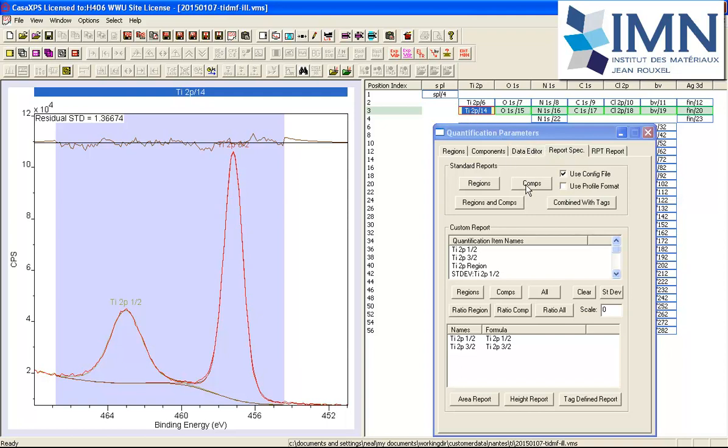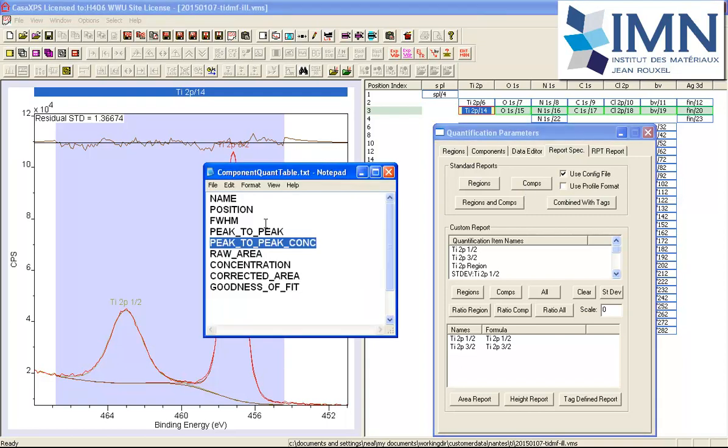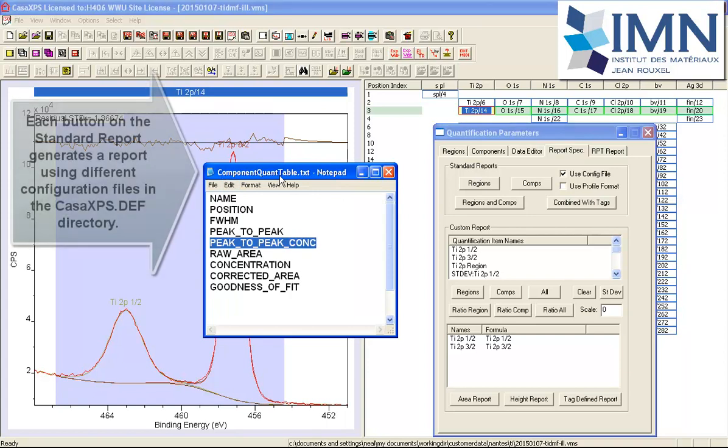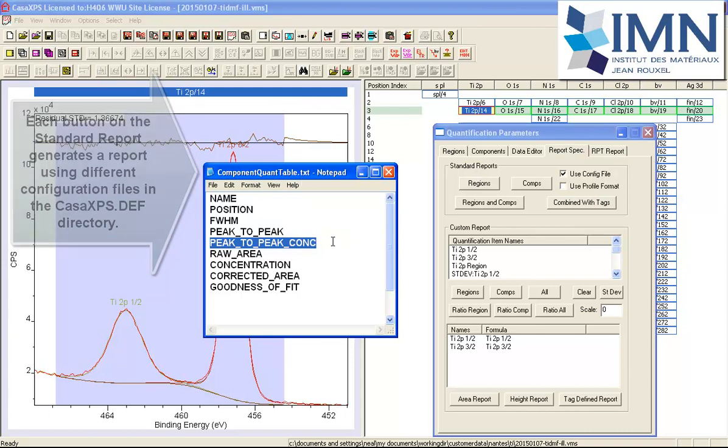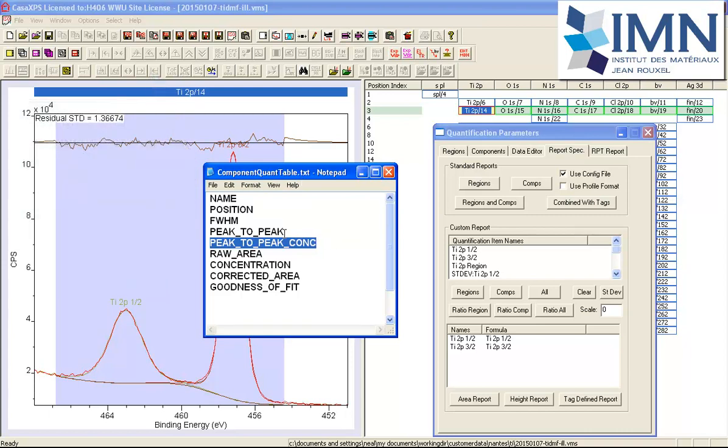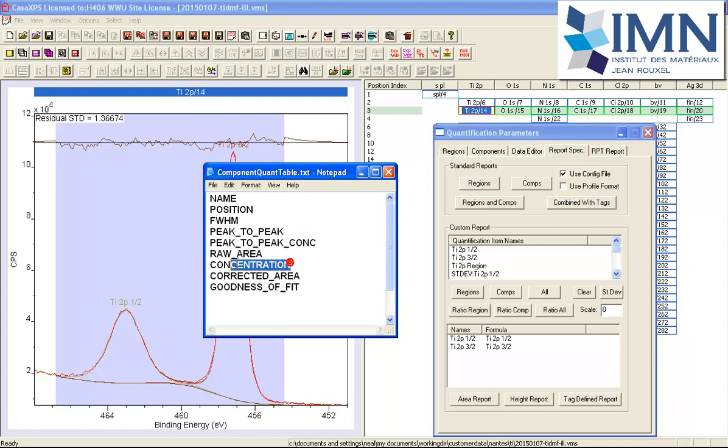This time I'm going to use the components option, and the components option has a corresponding configuration file component quant table.txt that's also in the CASAXPS.def directory. Again I've got the peak-to-peak and the concentration, and again the area and the area concentration. There are a few other pieces of information—this one different from the regions.